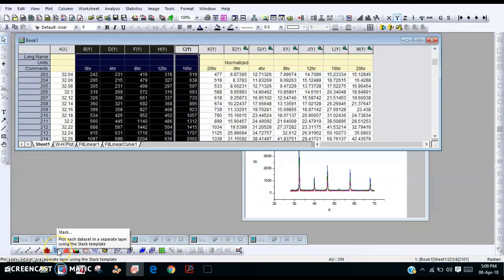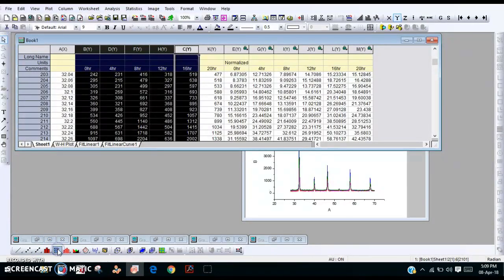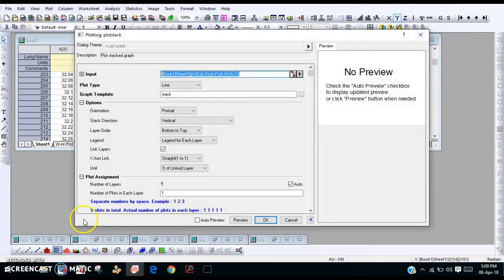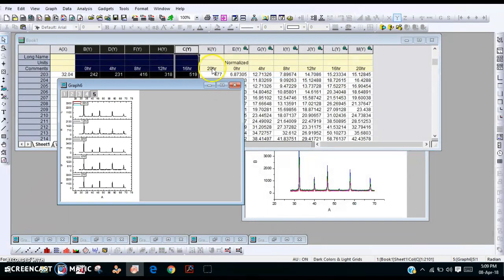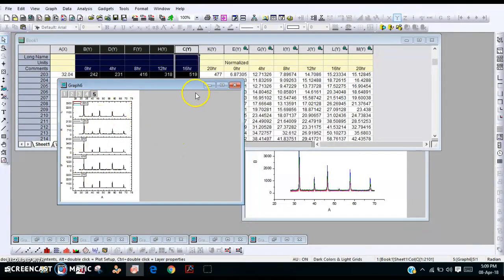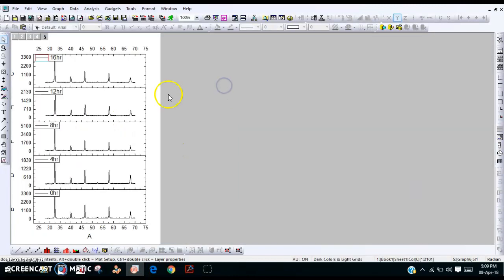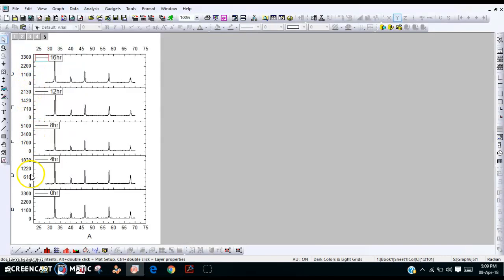There is an option called 'stack' that we need to use. Using this, you can plot the curves in separate folders in one image like this. Now we want to compare the intensities.